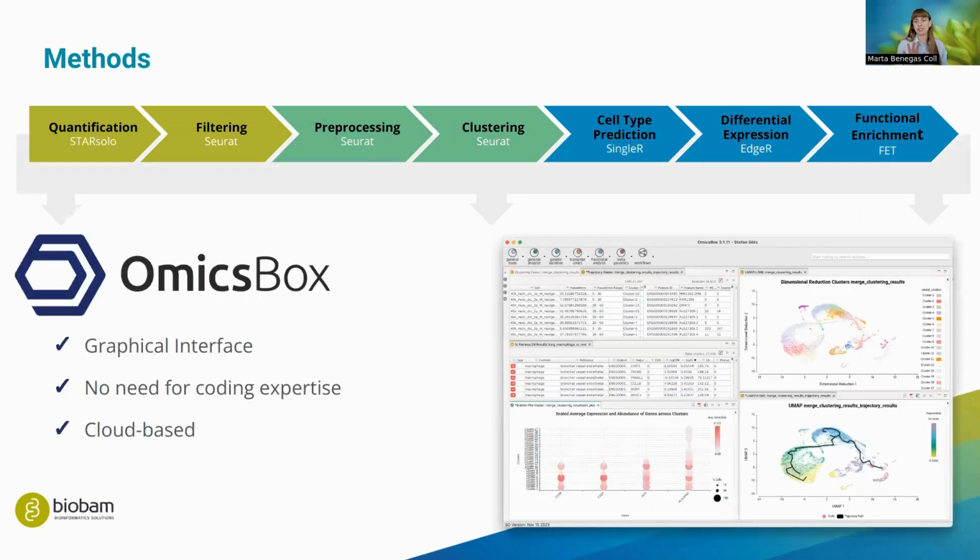All these steps are included or implemented into OmicsBox, which is a really user-friendly software with a graphical interface. So there's no need for coding expertise to run any of those analyses. And moreover, it's cloud-based, meaning that you provide your input data, it's sent to the cloud, the algorithms are run there, and then you retrieve the results.